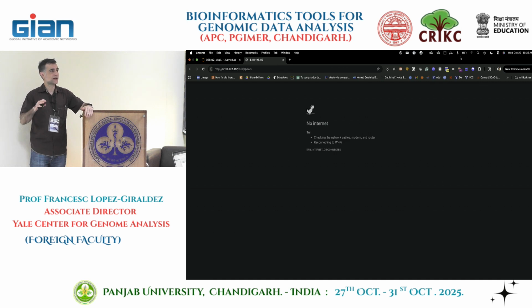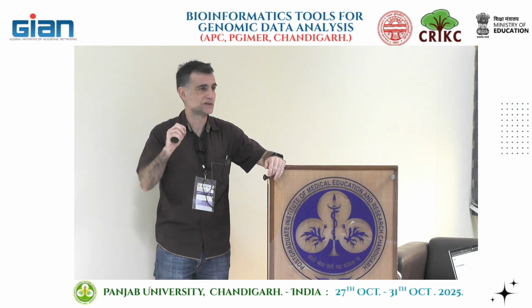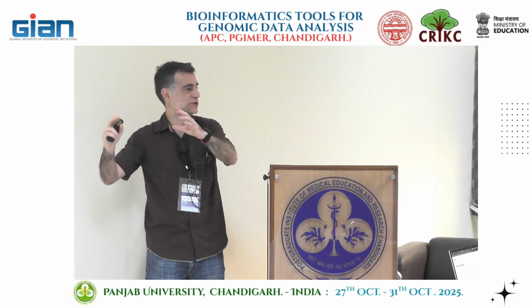So the question here is we can access the p-values and all that. We'll access that later. What we're doing here is exploring our data. And with that function, the only thing we ask DESeq2 is give me the coefficients. And the coefficients are what the formula is, which is the baseline and our fold changes. That's it.